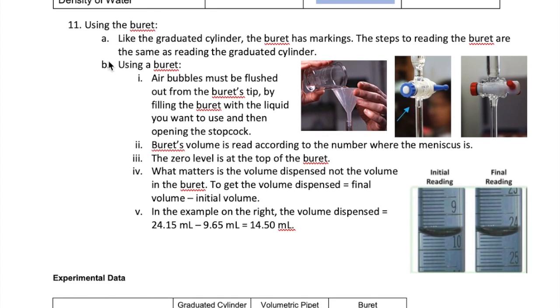The last glassware you're going to use is a 50 milliliter burette. A burette has many marks, just like a graduated cylinder, so you're going to read the volume using the same steps described earlier for the graduated cylinder. First, figure out the size of each mark. Then find where the meniscus is. Finally, add one more digit as an estimate of where you think the meniscus actually is.